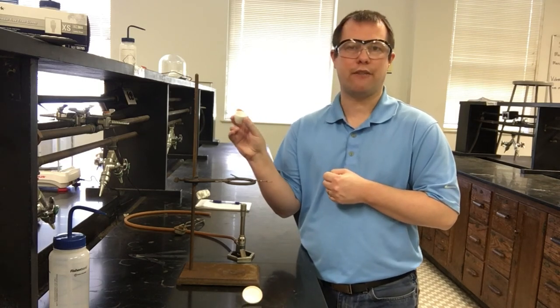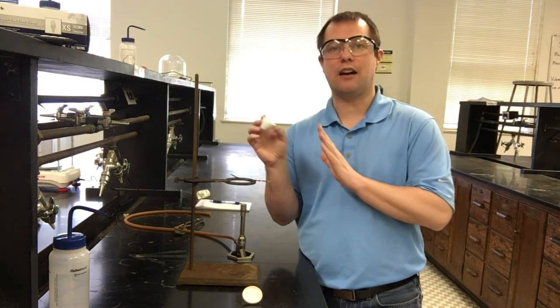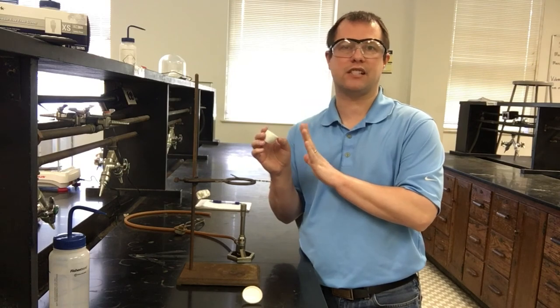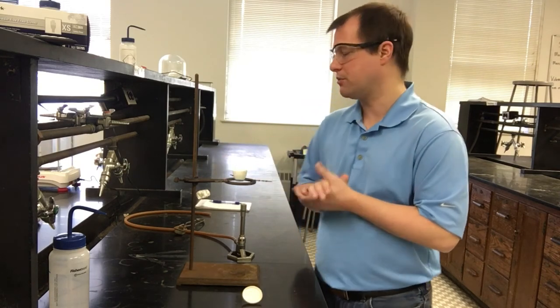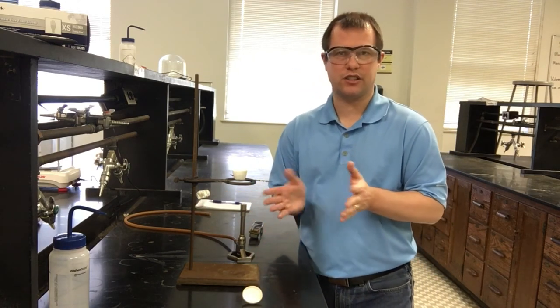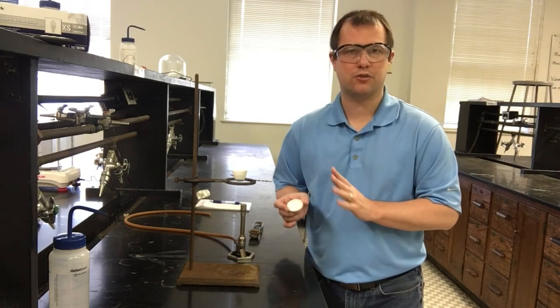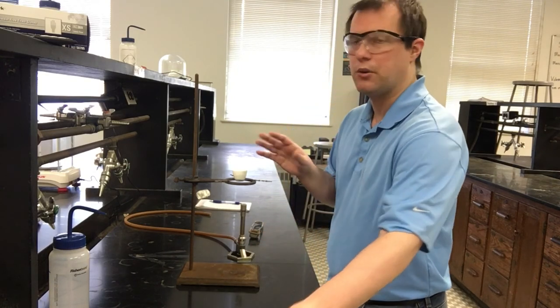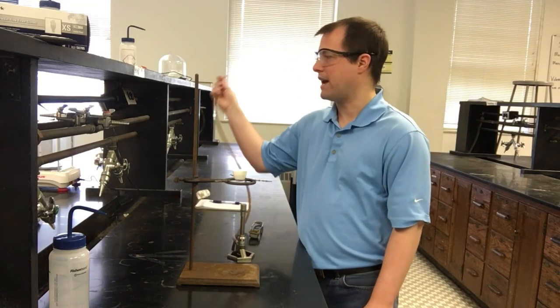We're going to perform a quick check to make sure the crucible is ready to use. I've already pre-massed this crucible — it came out to 15.141 grams. Now I'm going to heat it up and make sure its mass stays about the same. For this first part I'm not including the lid just yet, since the lid shouldn't have anything that changes with heat.